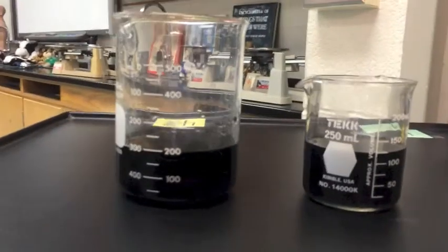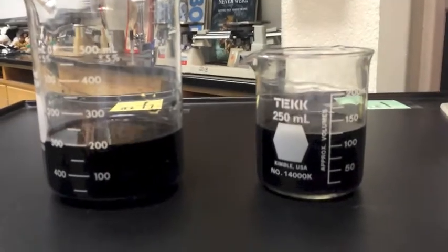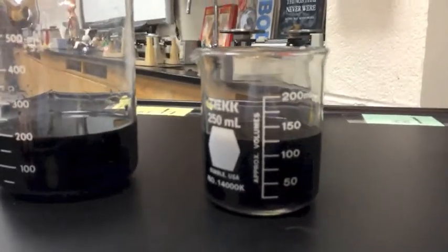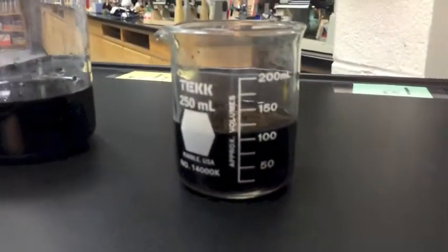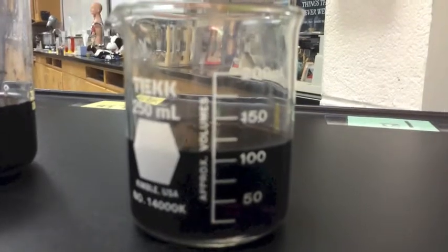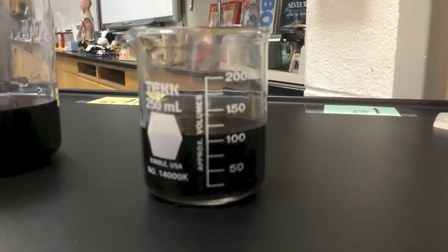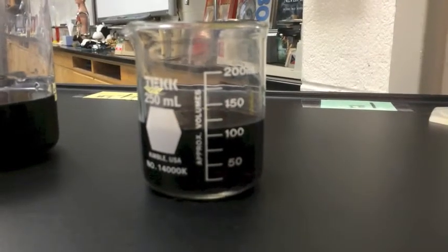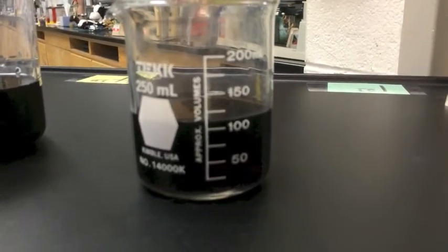Now, beakers aren't really all that accurate. They're used for much larger volumes of liquid. But we can actually measure in between by making good estimates. So let's say, for example, I were to pour some of this out, leaving me something less than the 125, but it's not exactly at the 100 milliliter mark. This is where your estimation powers come in, and you would then measure that somewhere about halfway, it looks, between the 100 and 125, and if you take 25 and divide it by 2, that gives about 112 or 113 milliliters. If you're within about 5 milliliters, I think that would be perfectly acceptable. A reasonable estimate is okay for our purposes.